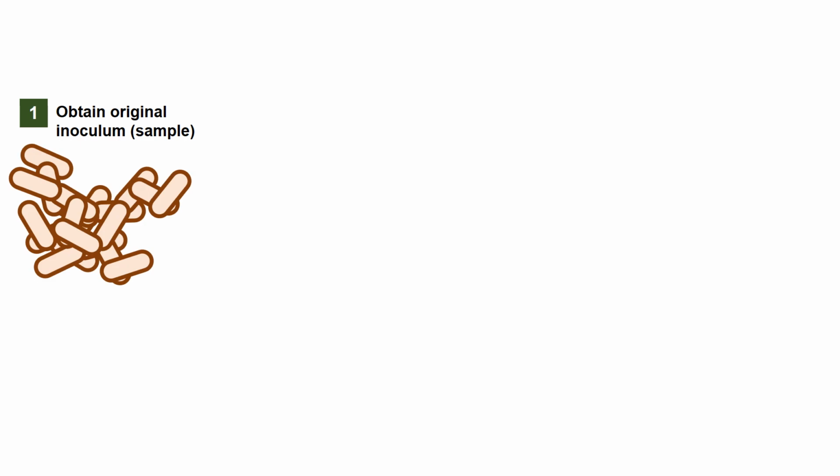Here we go. Let's move forward. Those are the bacteria. I've colored them orange. And let's say in the lab, I took this complex sample and I have it in a sterile media, and it's darkly colored orange to represent the sample being at a very high concentration. The darker the color orange here means the greater the turbidity of the sample. If there's a high turbidity, well, that's just a way of saying indirectly, qualitatively speaking, that we have a very high concentration of microbes in that tube.